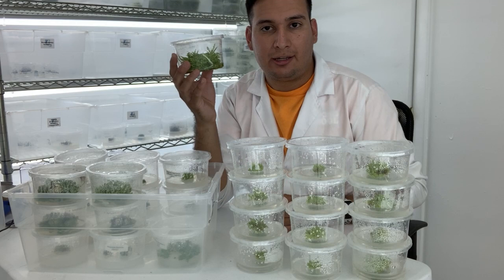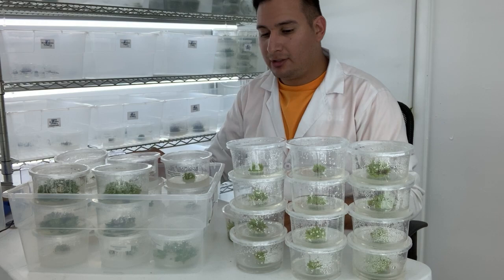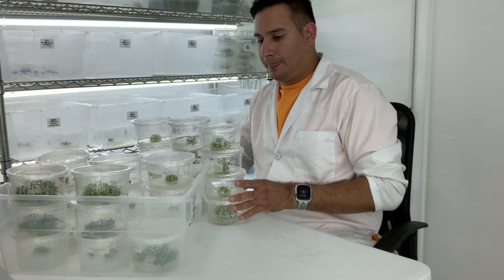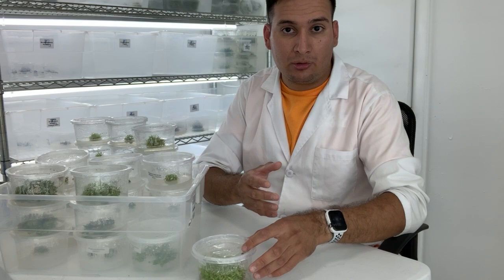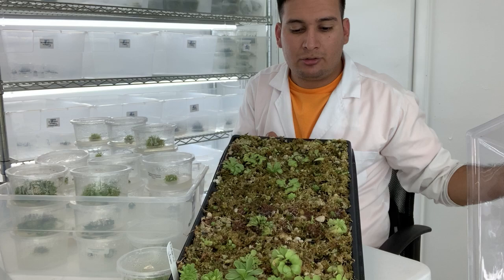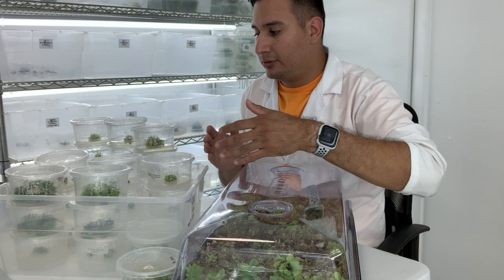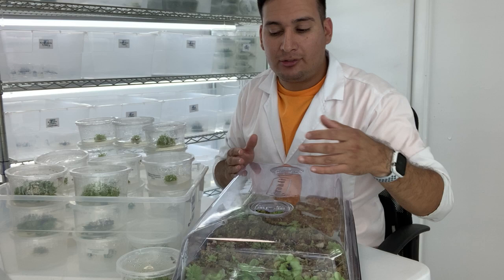I take one container and make 12 from it. Then I take 12 of the old ones and what I do next is take those plants out of tissue culture and place them into soil — acclimating them outside of tissue culture. The plants I already declassed previously are being acclimated to outside conditions, and in a couple of weeks they will be ready to sell. So I make 12 new ones and remove 12 old ones — each container has close to 100 plants or more.